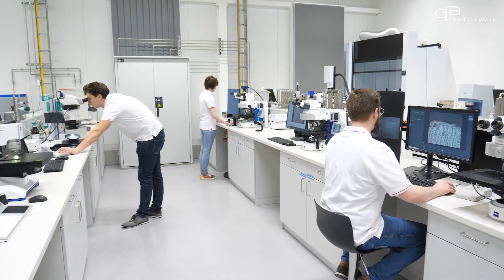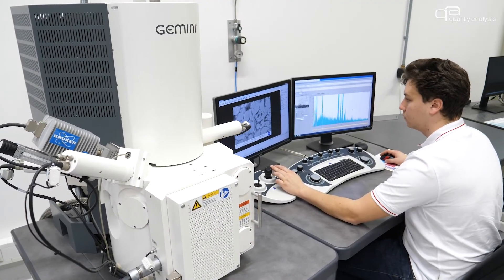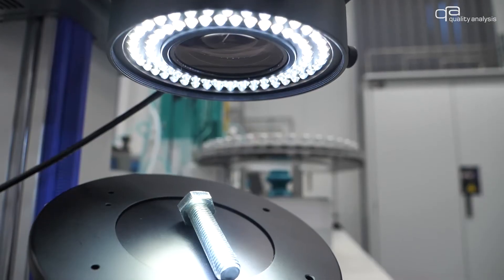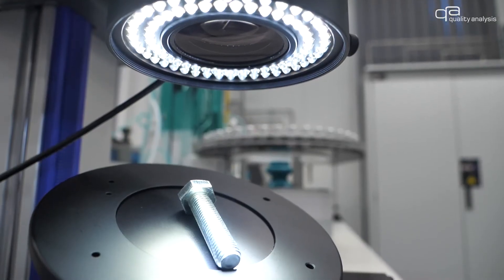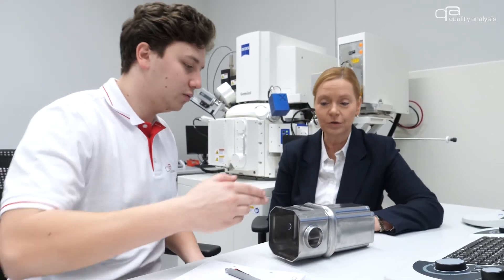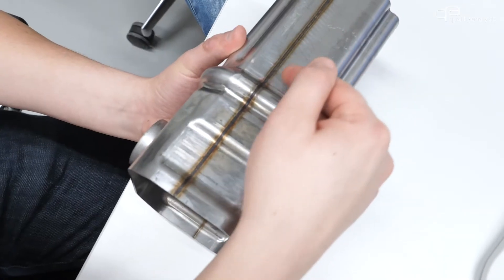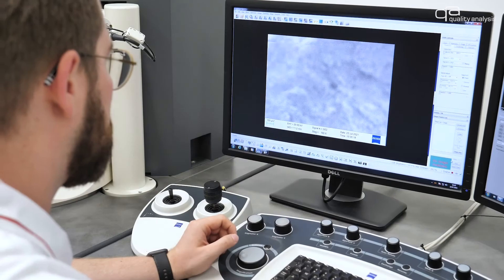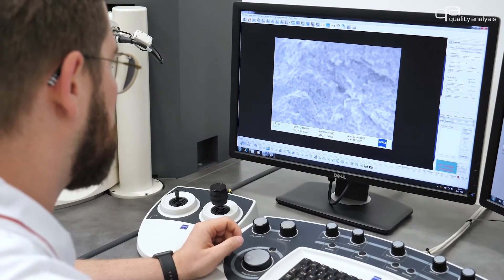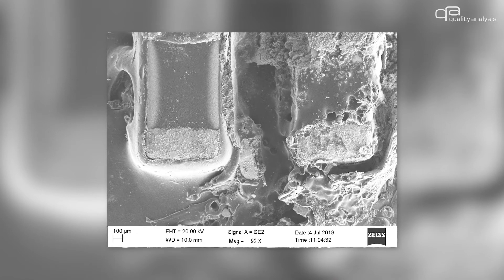A wide variety of state-of-the-art light microscopy systems and scanning electron microscopy systems are available for a wide range of analysis options and procedures. One of our focal points is the systematic assessment of technical damage on statically and dynamically loaded components. Another focus of our work is the evaluation and fault diagnosis of electronic components.